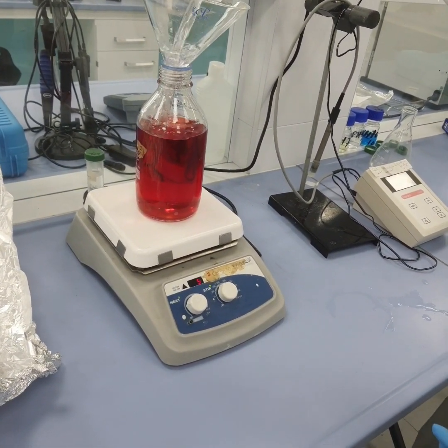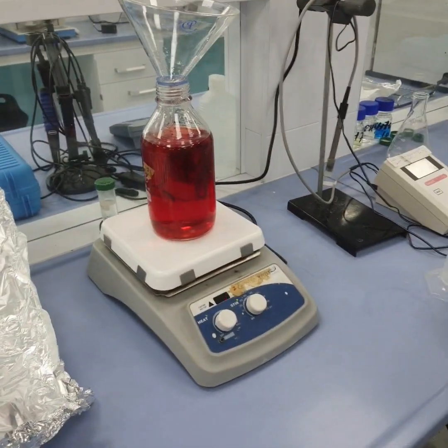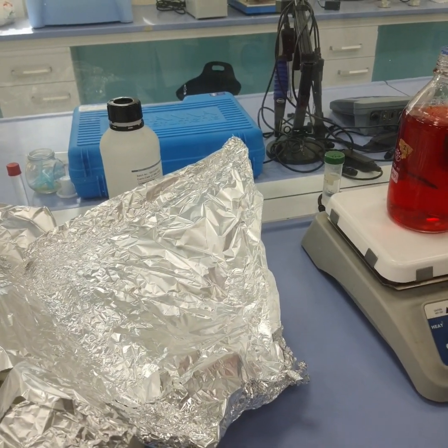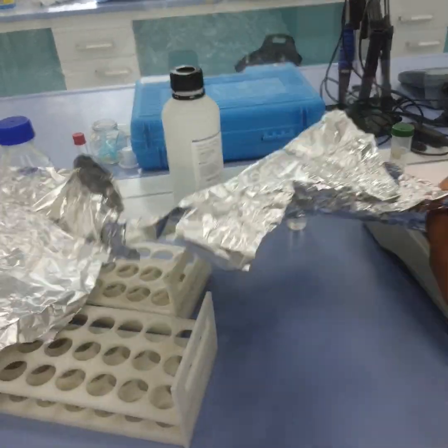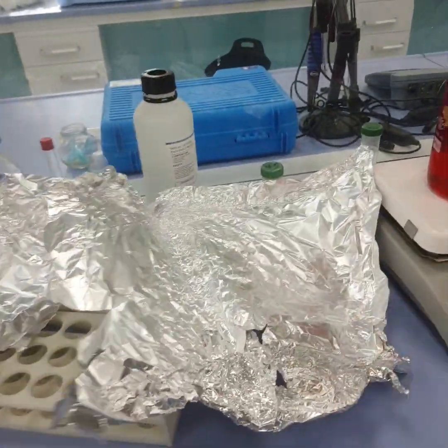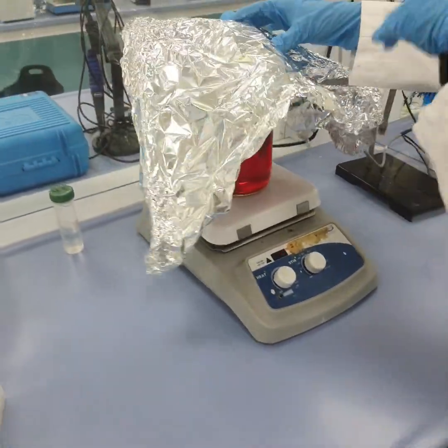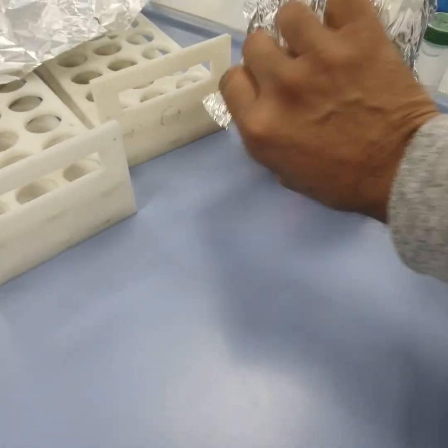Can you remove the funnel, and then you should cover this. Cover it with aluminum foil, even the top, and then we'll wait for around half an hour. So this is well mixed.